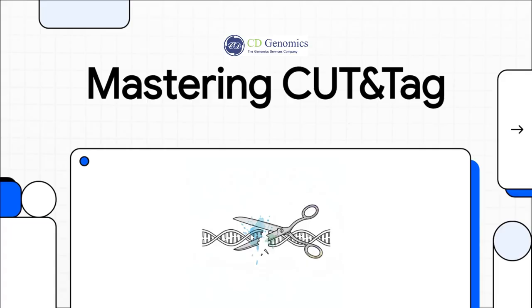It's tough. Today, though, we're focusing on a major methodological breakthrough that is literally changing the game for molecular biologists everywhere. It's called cut-and-tag sequencing.